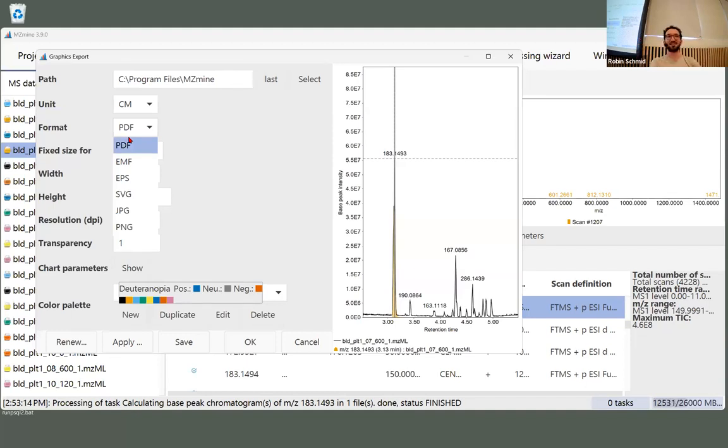I can change colors. I typically even have everything in one Illustrator file, and then I can recolor everything at once. I can say, this orange I don't like, I want this other orange.